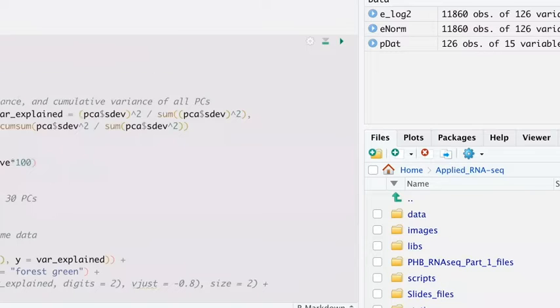So we do T, which stands for transpose, and then the name of the data frame. Do not open this data frame because when you have more columns than you have rows, it crashes R. So it might take a long time for R to start again. If you want to just look at it, you can type in the console T.